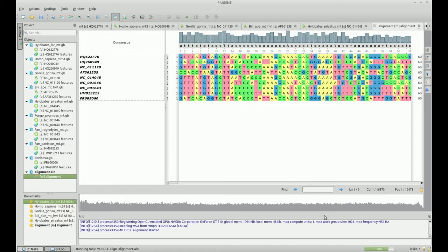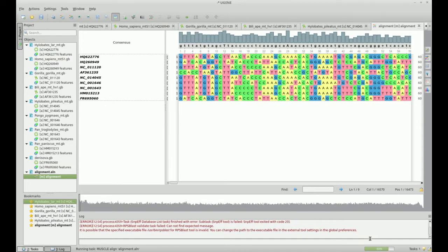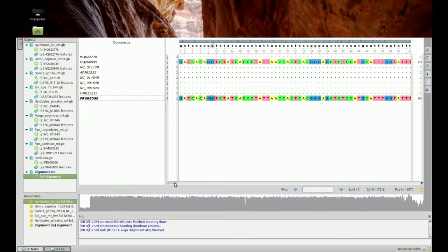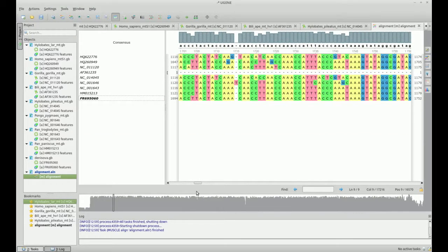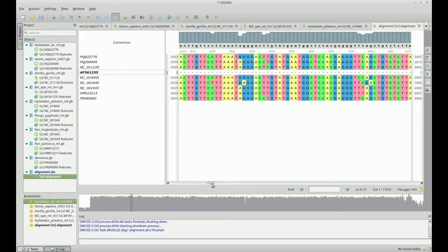And it's going to ask us a bunch of things, and we'll just go with the standard alignment options, and we'll press align. Notice here, these are large sequences, so it's doing this. Don't try to do it again. You'll waste your time. Okay, so now that it's actually finished, this actually took a while, and I never suggest doing a large set of sequences like this. You can see how it's performed the alignment. And now it looks like a real alignment. Notice that all these dashes correspond to this one figure or sequence here that corresponds to that partial sequence to begin with.